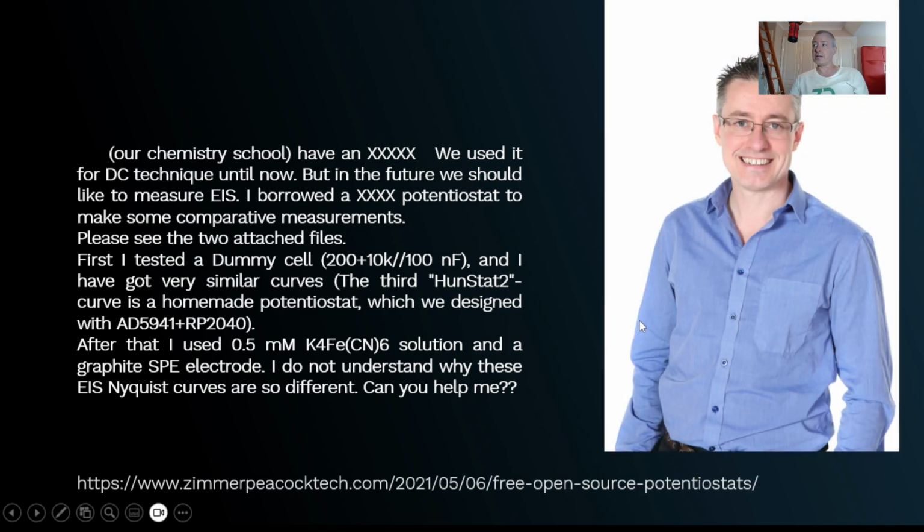And I've been advising them. As I say, I do have a link to open source potentiostats on the website. At ZP, I want to say now that I think the real value these days in the world of electroanalytical chemistry, sensors and biosensors is the development of the assays. So I hold this up, and it's developing the assays that work on electrodes like this. That's where the real value is.